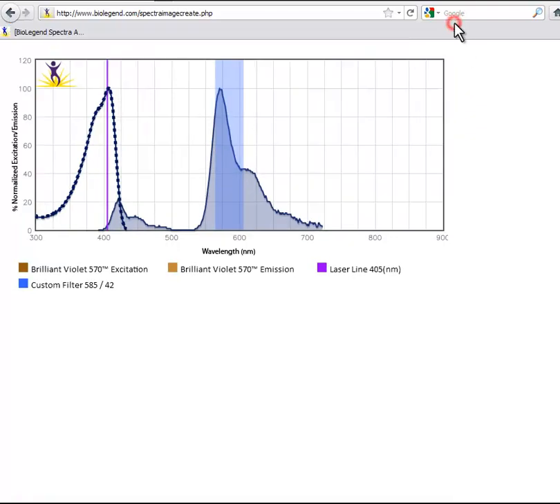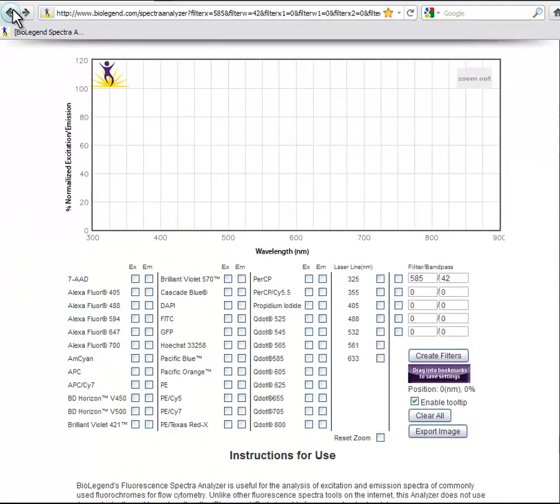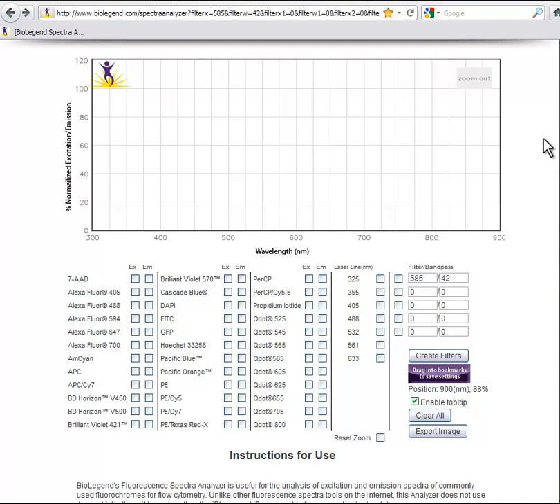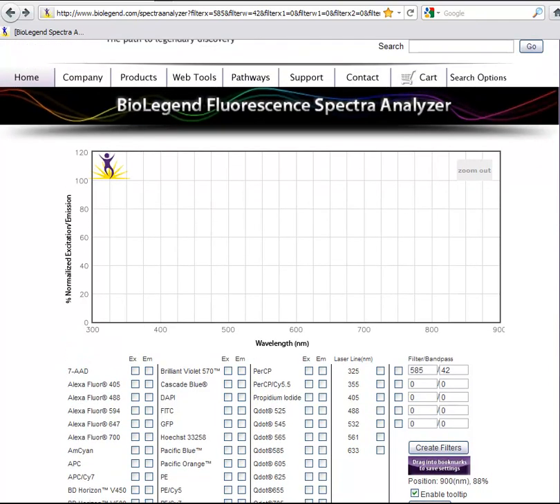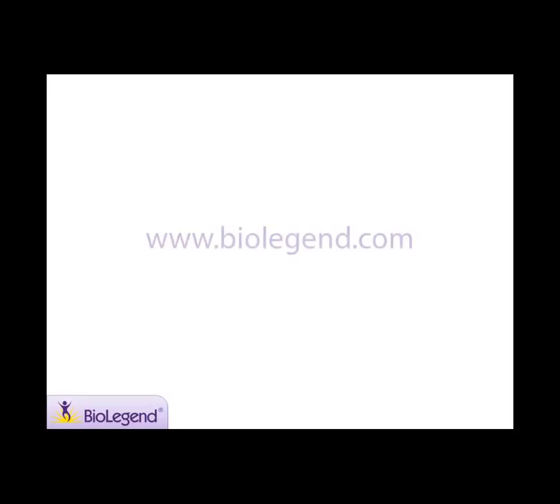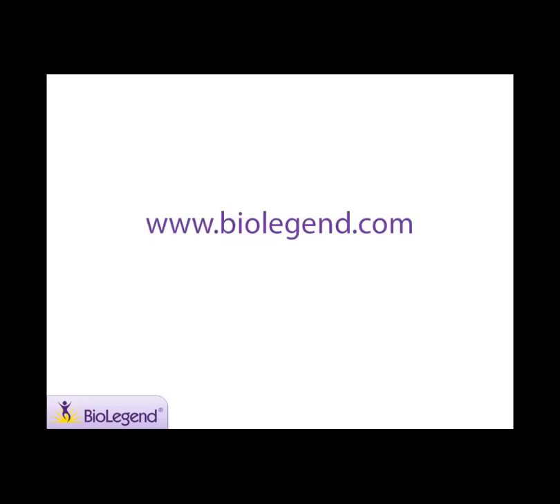BioLegend's Spectra Analyzer is a great tool for comparing fluorophore excitation and emission data for use in flow cytometry and other applications. To view other helpful web tools, protocols, and other resources, browse the new BioLegend.com.